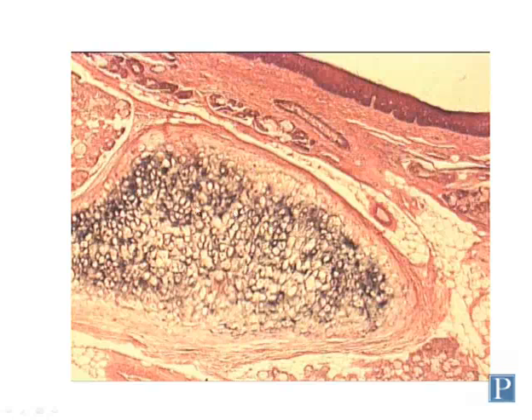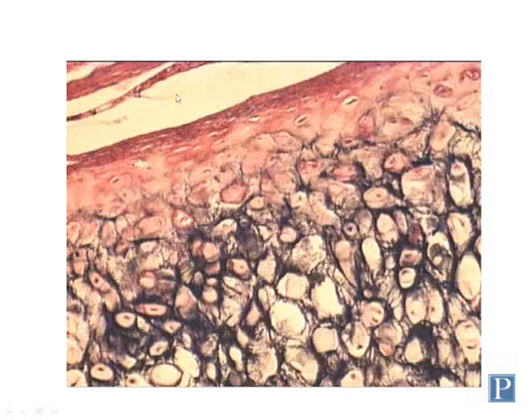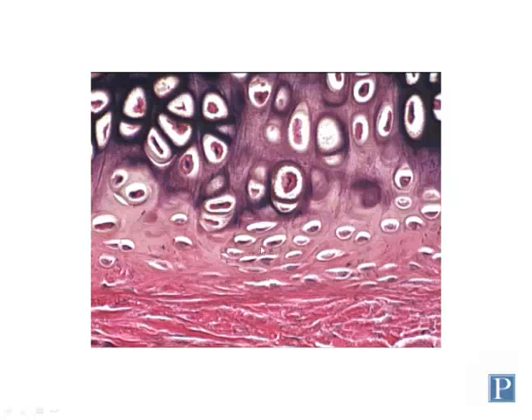So this is elastic cartilage right here, surrounded by a perichondrium, again composed of dense irregular connective tissue. Here's a higher magnification view. Here you can see the perichondrium. Elastic cartilage also has a chondrogenic zone containing small chondroblasts within lacunae, as you can see here. Here is more mature cartilage with chondrocytes in lacunae, and you can see that this particular tissue has been stained with an elastic stain that actually allows us to visualize these elastic fibers in more detail. So those are these kind of blue-black fibers.